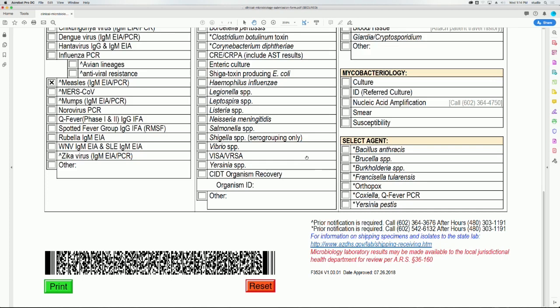To start a new submission form, click the red reset button at the bottom of the page. Clicking the reset button clears all sections of the form.